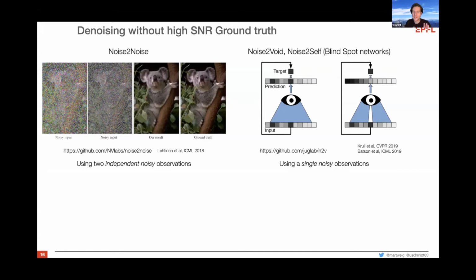So far you always need it, and it's not pertaining only to denoising, but it works as well, and I will just quickly show you another example. It is as well for upsampling or for deconvolution, right? You always have to provide these pairs of the same scene, just taken under different conditions. And it could be low SNR, high SNR, or low SNR downsampled and high SNR upsampled. But you always have to have these two pairs of the same scene, right? Which is of course a limitation because sometimes you don't have that, right? And this slide is just showing you what happens if you don't have that. So, okay. Was this the answer? Yeah, because I was wondering, what if we don't have those upsampling images? What's going to happen?